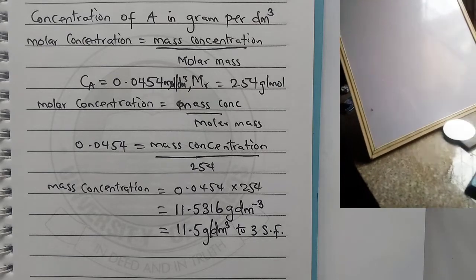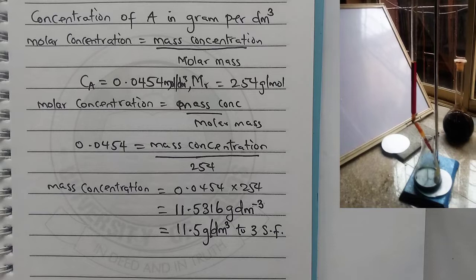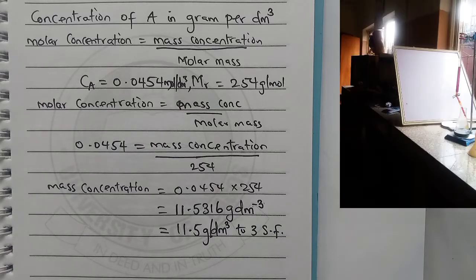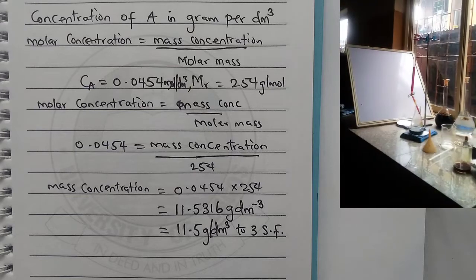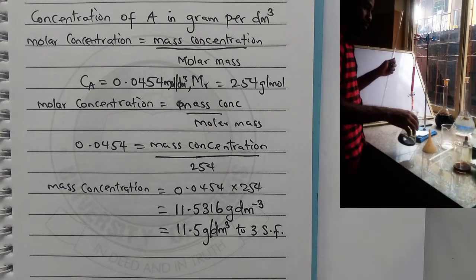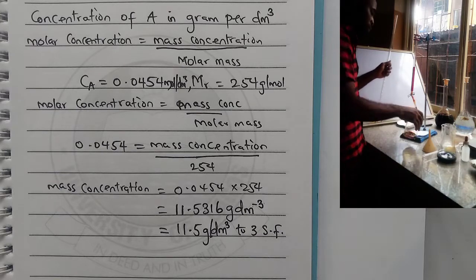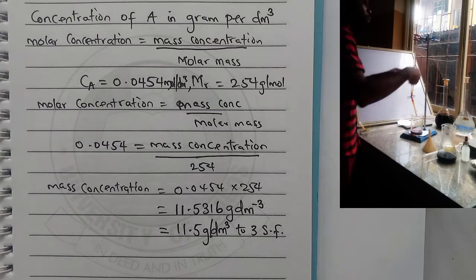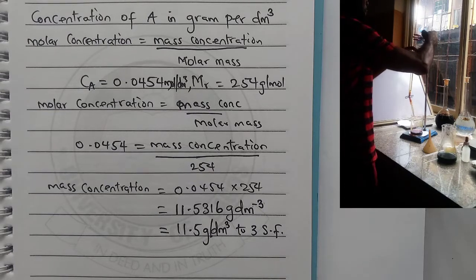As we are adding iodine solution, there is an increase of iodine, and towards the ending there is a little bit of iodine solution that can show the blue black coloration.